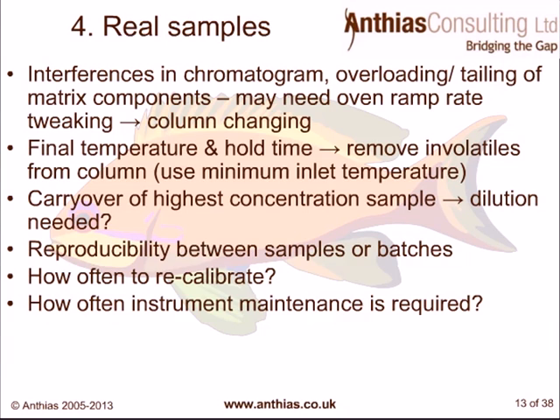And also thinking about how often you need to do instrument maintenance. So if you're doing lots of dirty samples, you probably need to change your inlet liner much more often than if you've got clean samples. That is very application dependent, but it also really depends on the types of samples that you are analysing, and trying to identify those dirty samples before they actually get onto the column.